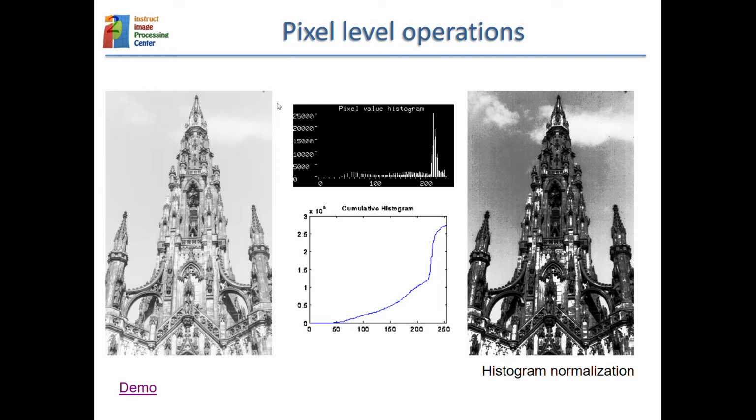Only very few gray values in between get a value that is different from 0 or 255. And of course you can go in the other direction, so you can make it smoother, so that everything is almost mapped onto the same output gray value. That is why now we have so little contrast in our images.